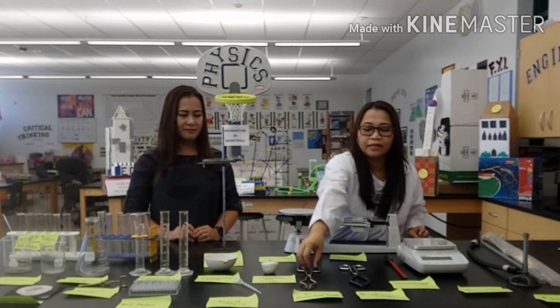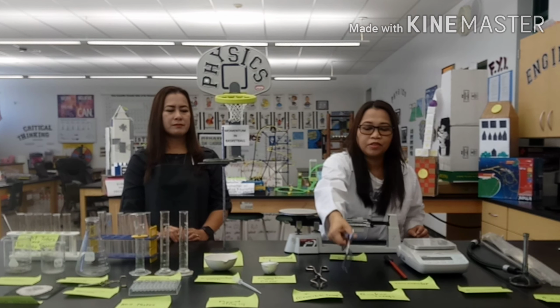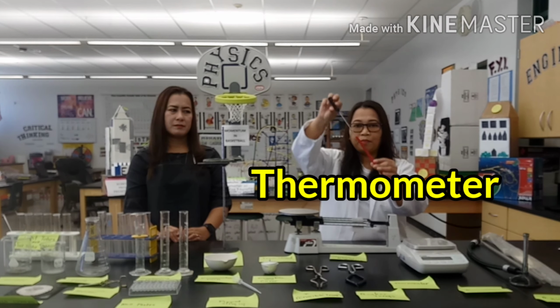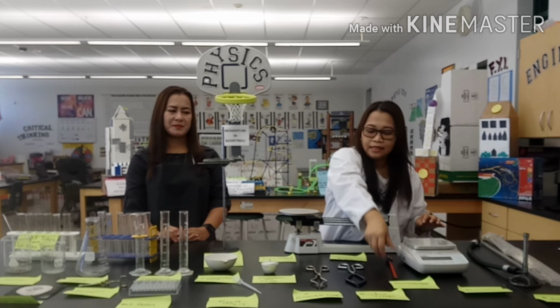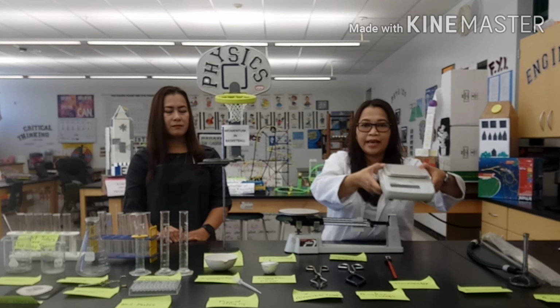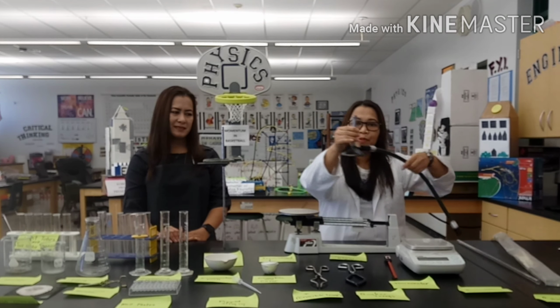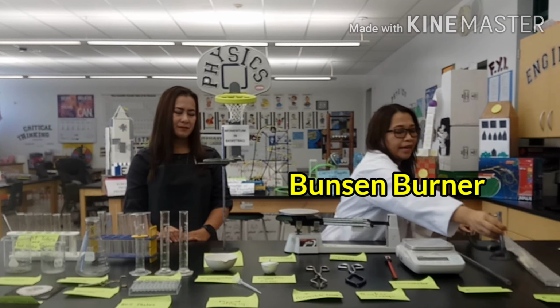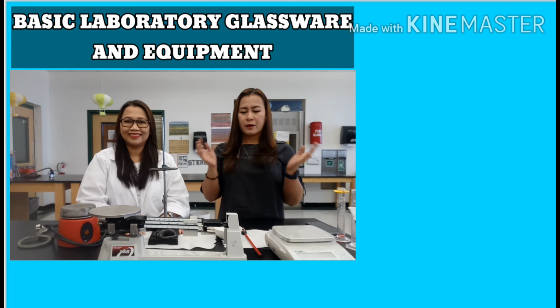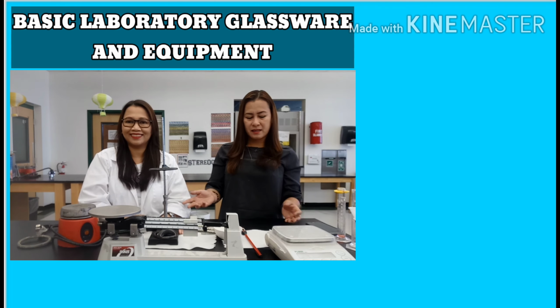And then we have here the crucible tongs. Alright, and then this is the beaker tongs. And then this is the thermometer. Then we have here the triple beam balance. And then we also have the digital balance. And in here I have a Bunsen burner and buret. Alright. We have here right now tools for heating.